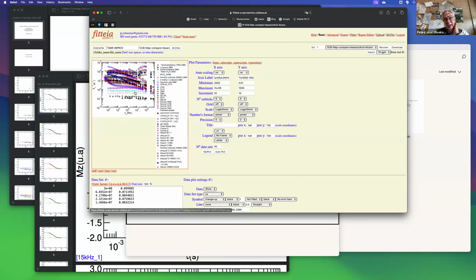And the challenge now is to use this data to characterize the system, knowing that by the profile alone, by the shape, it is not easy to be sure that we are in the presence of a particular system, because we can find another, entirely different system that has a dispersion profile that is not so different.